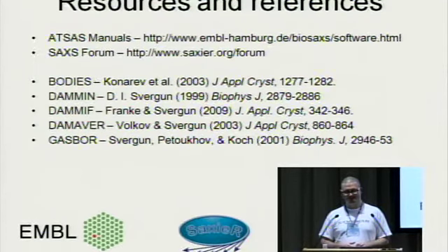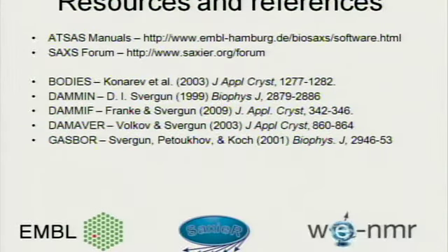Yeah, so once we had another workshop, they gave examples that if you have, for example, a histag, which is just about 10 amino acids, and in structural biology we generally use that to purify protein, but it's usually not very structured.